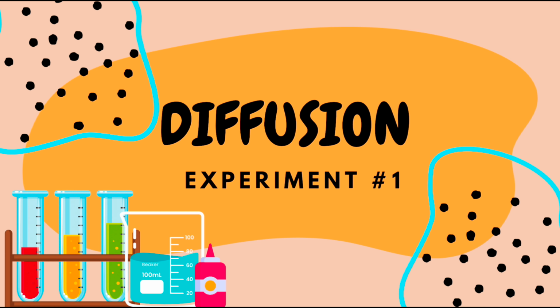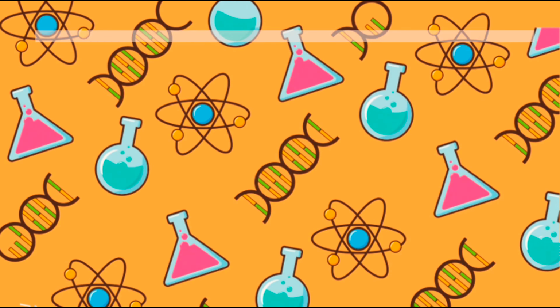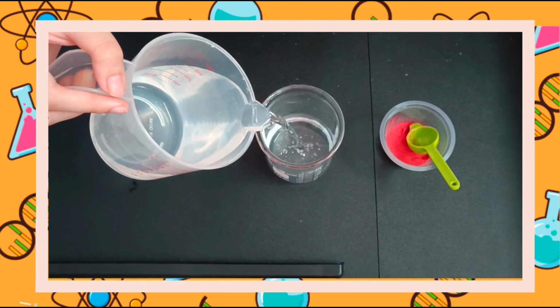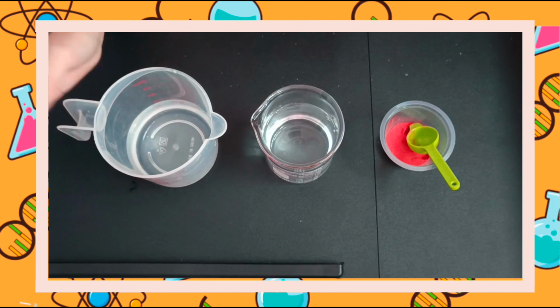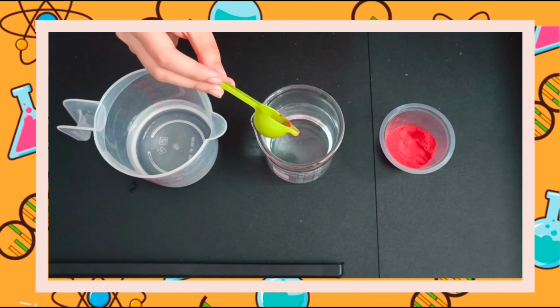The materials required in this first experiment are beaker, powdered food coloring, and water. Pour a decent amount of water in the beaker, and add a pinch of powdered food coloring.